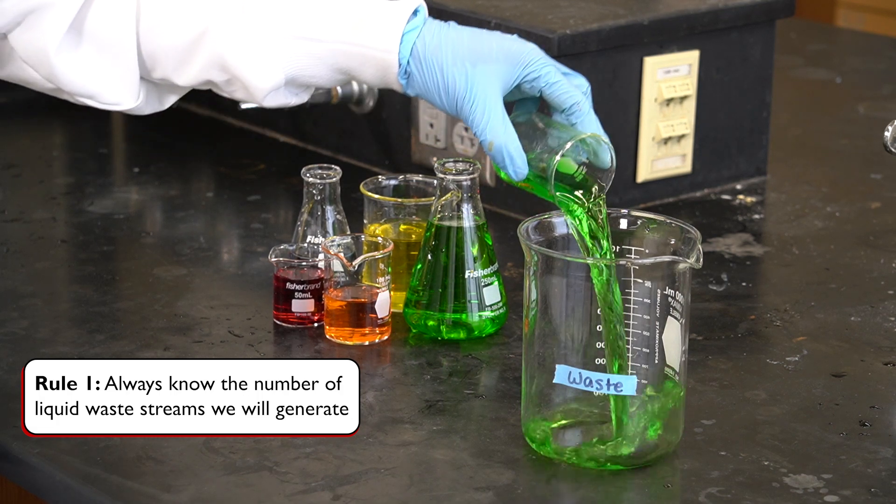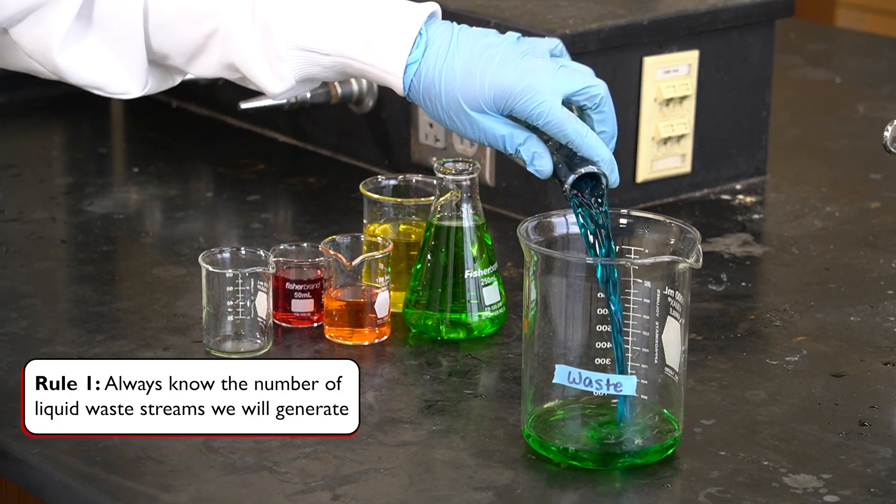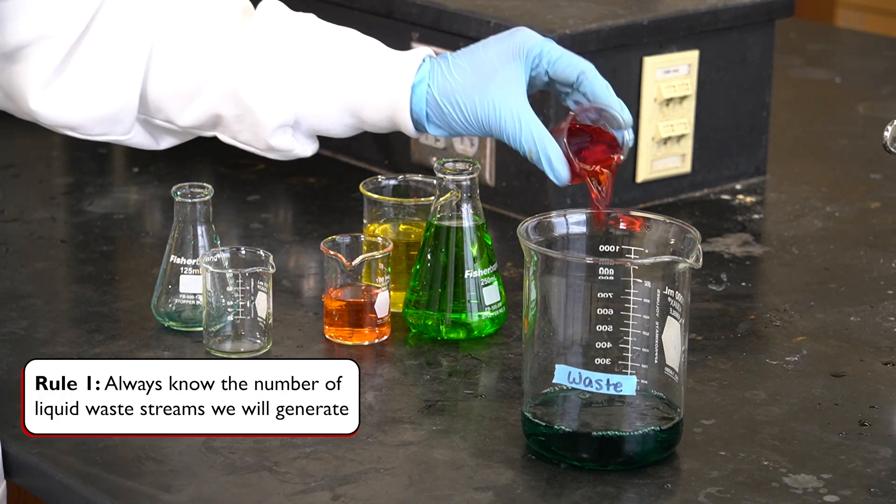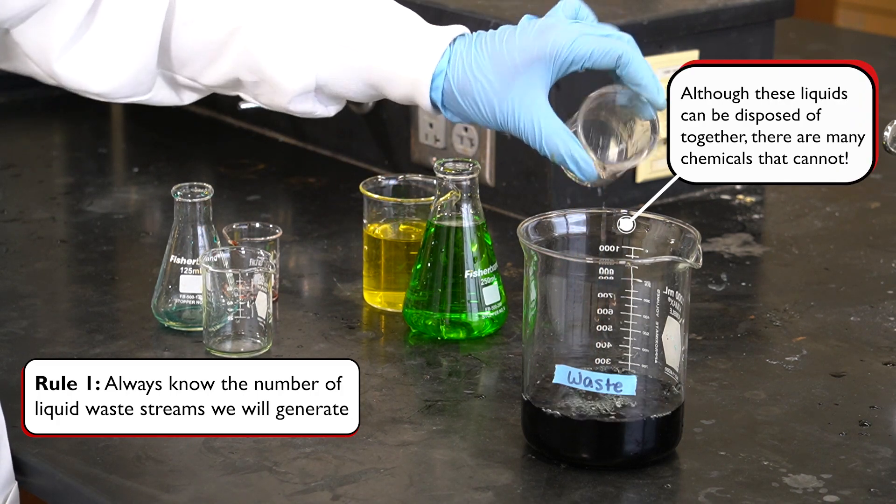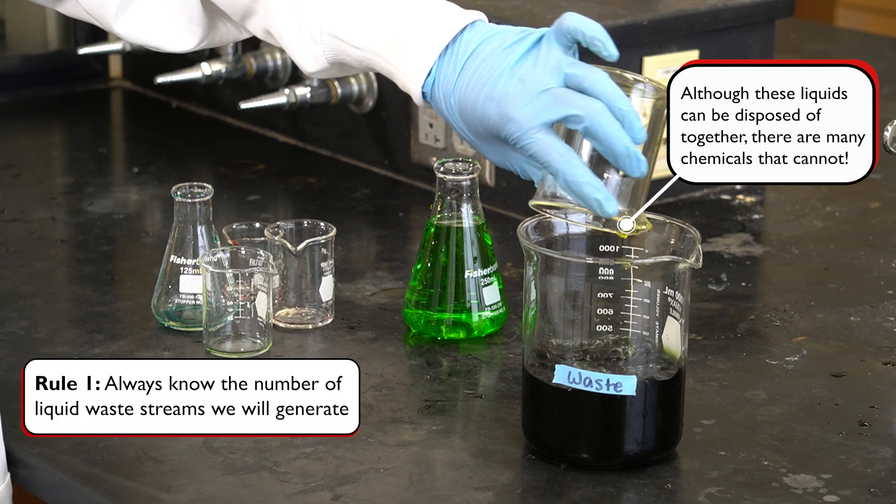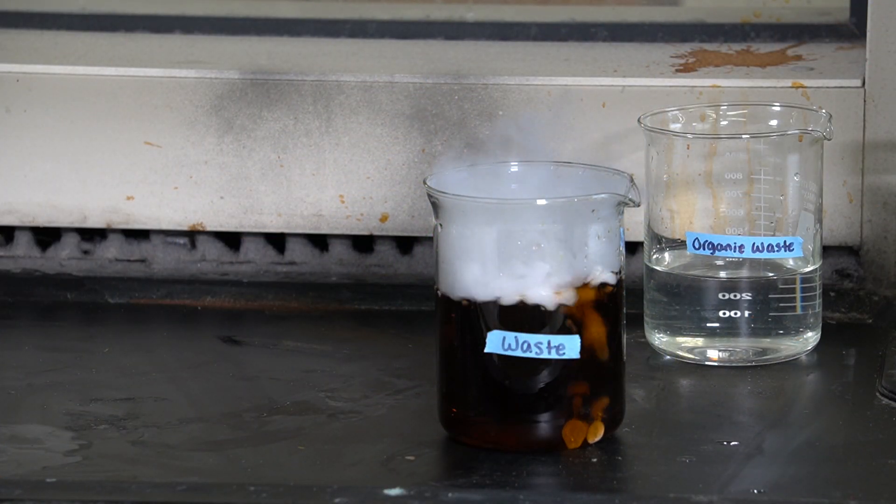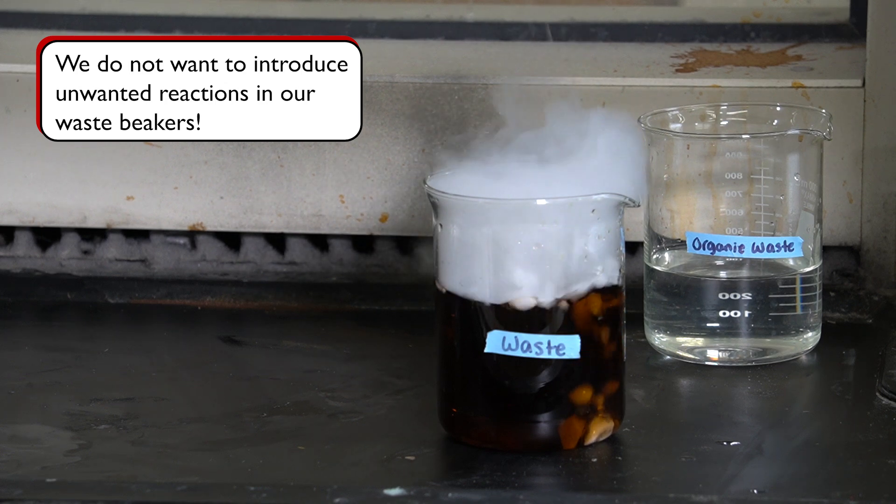Rule number one: always know the number of liquid waste streams we will generate. In other words, the number of different types of liquids that will need to be collected. While some liquids can be disposed of together, there are some types of liquid waste that are incompatible and should never be mixed. Mixing inappropriate liquid waste together can cause unwanted and potentially dangerous chemical reactions. If you're not careful, a waste jar can easily turn into a bomb. That must never happen.